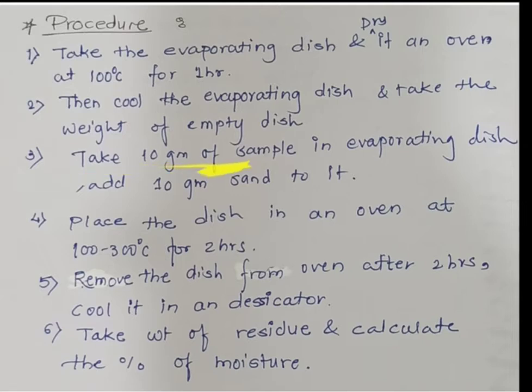Then weigh 10 gram of the detergent sample and put it into the evaporating dish. After that, add 10 gram of sand into it. Then place the dish in an oven at 100 to 300 degrees Celsius for 2 hours.